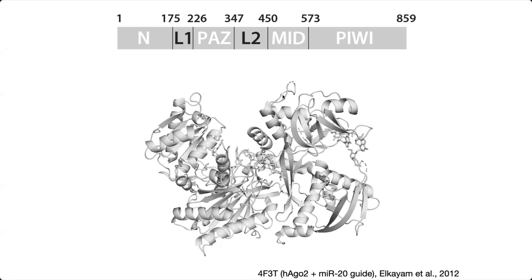But the benefit of HDX-MS is that it's happening in solution. You don't need to actually freeze the protein. You can get information about regions of a protein, say, that are not visible in X-ray crystallography for reasons I'll talk about, or regions that are dynamic, and so they don't have a fixed structure, or they're actually changing over time.